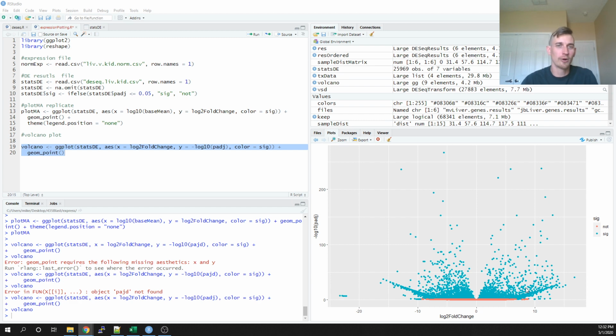But again, not all volcanoes look like this. We have a lot of expression values that are different, and so in those cases, again, if we looked at the same tissue, you would most likely see dots kind of hovering in the middle with only a handful of them actually looking differentially expressed. But here it really just goes off in both directions.